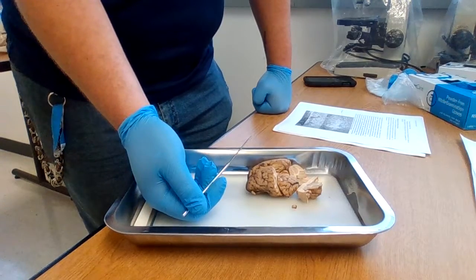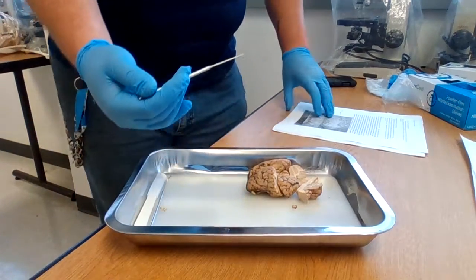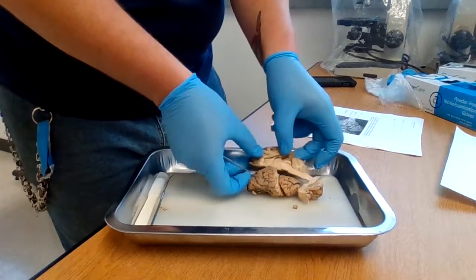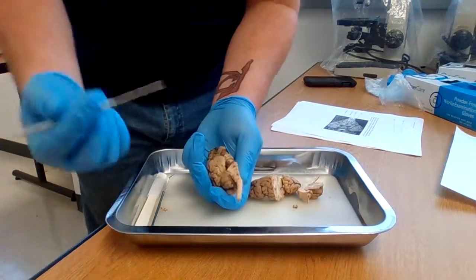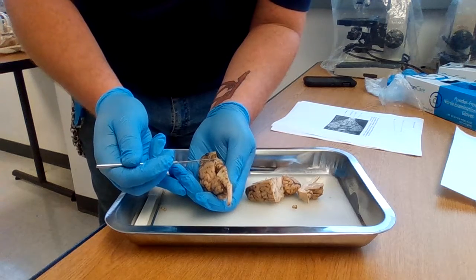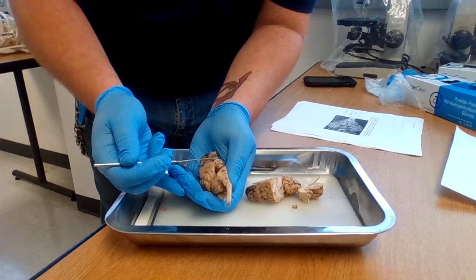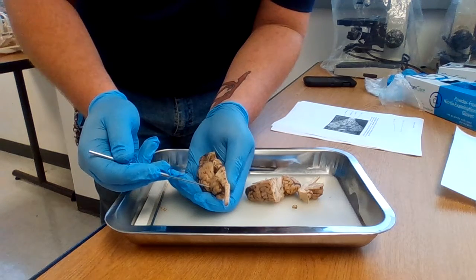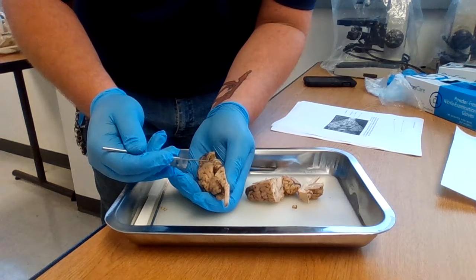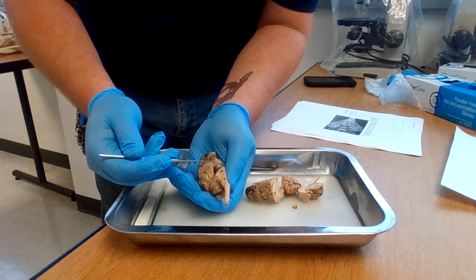Dura mater. The dura mater is going to be the line around the brain. I already took it off. It's a lot different from the whole brain. So, cerebellum, pituitary gland, the medulla, and the pons.